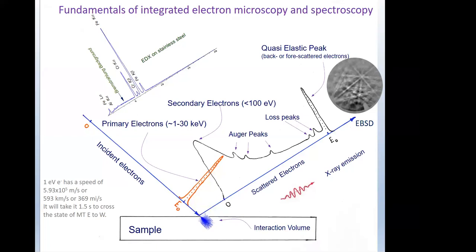Well, I will actually ask Dave to answer. Phase, let's take titanium nitride. It's titanium nitride, but it has different phases. Phase actually means crystal structure. Is it cubic or is it hexagonal? That's what I mean by phase identification. Maybe I misrepresented. And orientation is the orientation at that particular location. It may be different 1 micron later.